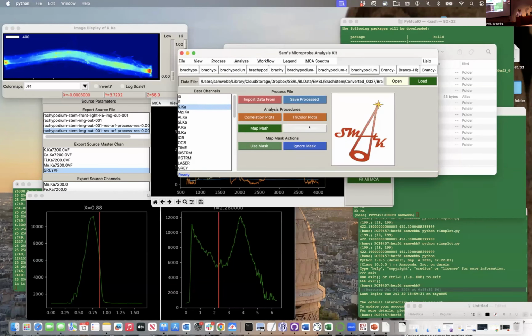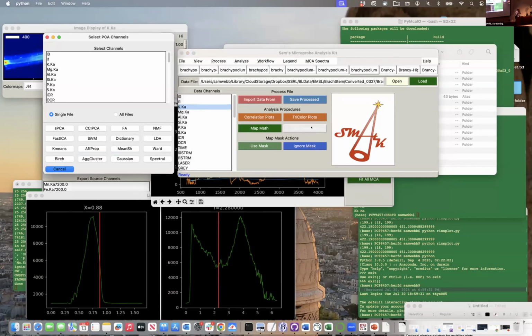We have lots of different versions here. And you can do things like PCA, factor analysis, non-negative matrix factorization, all the things we talked about yesterday, k-means clustering, Gaussian clusters. If you go to the scikit-learn page, it'll show you what all those different ones mean. They are basically for different topologies of your data. Most of the time, while they sound cool and fancy, they are all different algorithms for doing clustering. They work really well on really tiny data sets, not really good for large data sets. So things like k-means and Gaussian are typically the best way to go about your data.